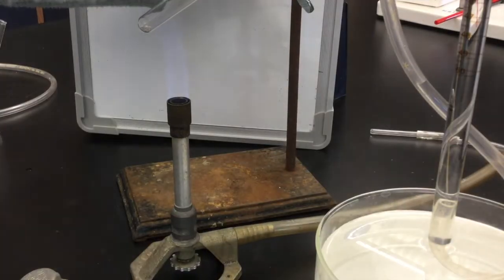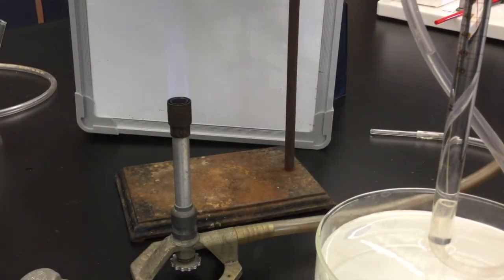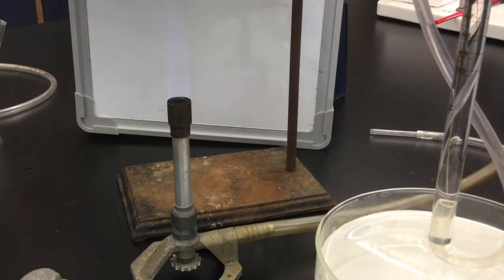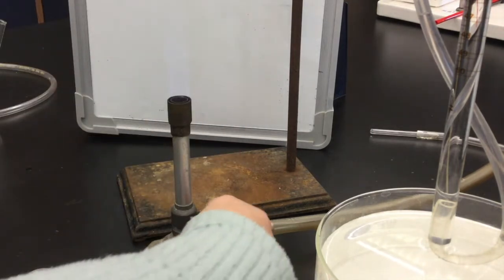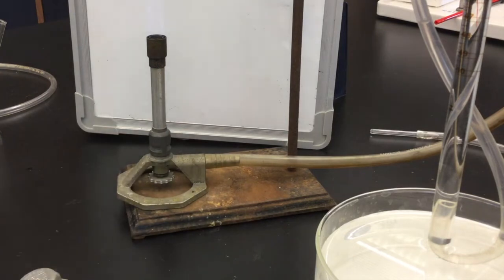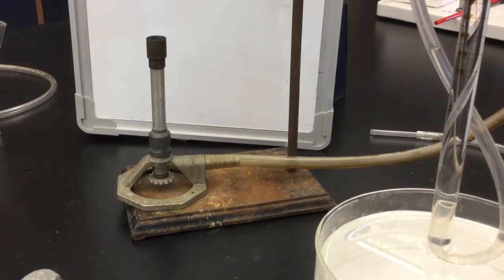Begin with a cool flame by adjusting the oxygen to a lower setting. You may just see yellow in the flame. You may need to adjust the height of the gas as well. Then you can place the flame underneath the test tube, only at the bottom where the reaction mixture is.